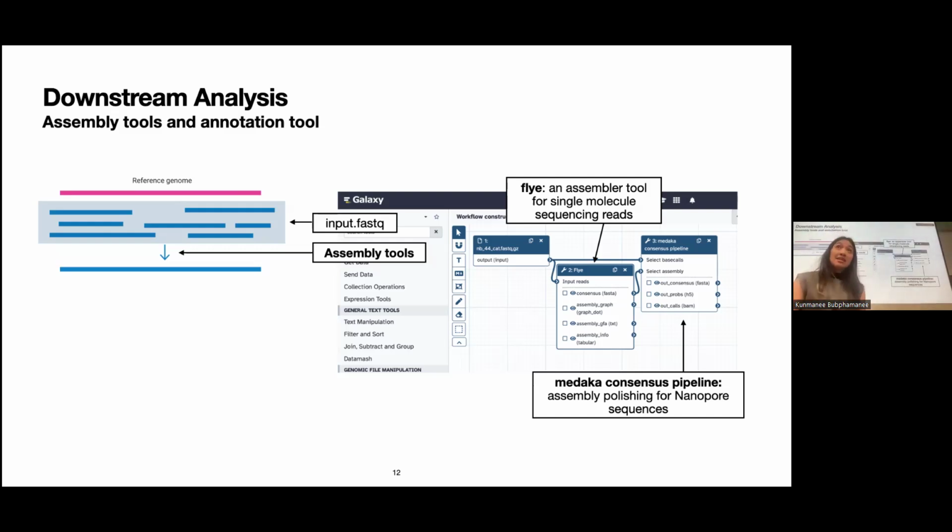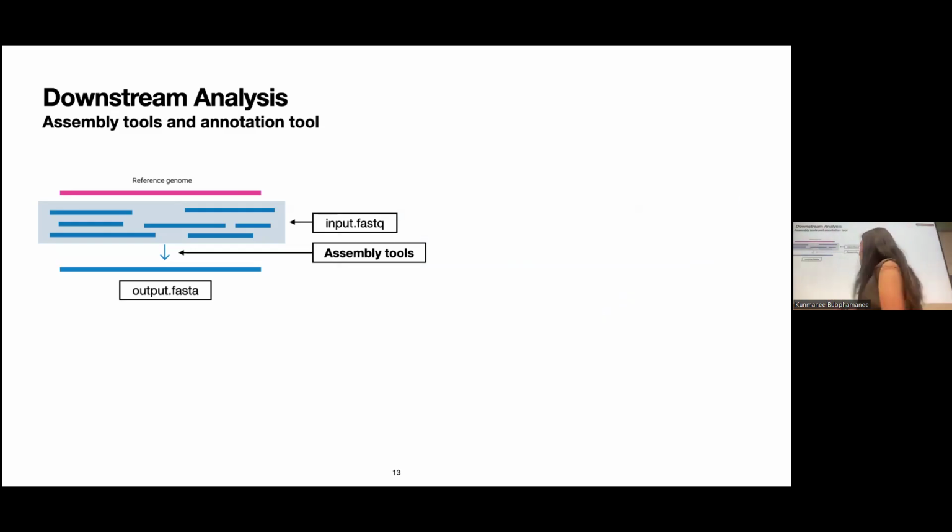Sometimes it comes out nicely and shows one contig, one whole full assembled genome. Sometimes it doesn't, it gives fragments and we can still work with that. But I think most of the time we get one nice contig. Sometimes it gives two, which suggests there's a contaminant in that culture. So now we have the output data of one whole genome.